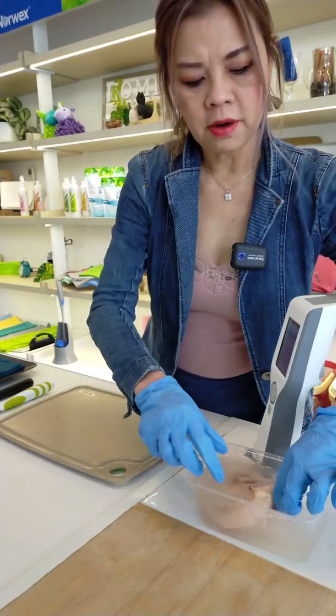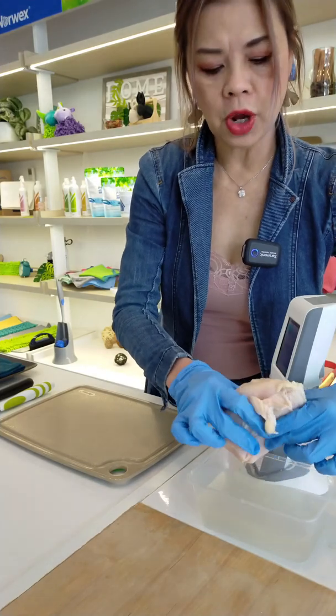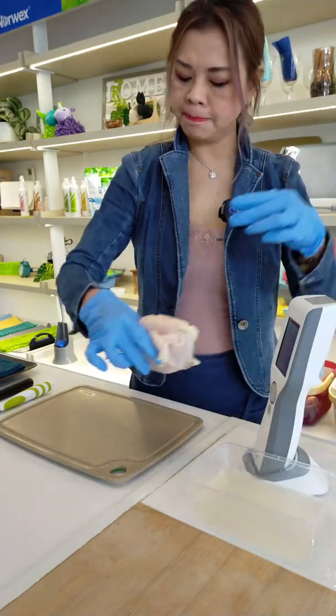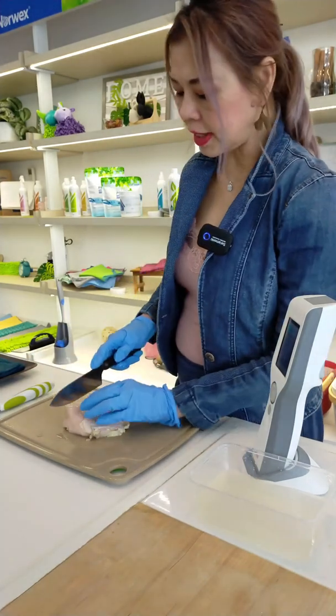I'm going to do ATP testing for the counter cloth as well as our kitchen cloth on the chopping board. First, I'm going to cut with just a normal stainless steel knife.